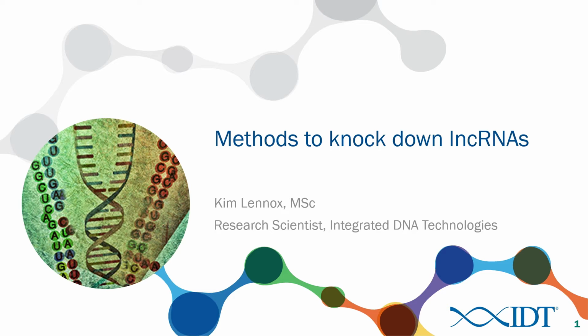Thank you for the introduction. Today's webinar is going to focus on optimal methods to knock down long non-coding RNAs. I'm going to compare two different commonly used RNA knockdown strategies, RNA interference and antisense, for their ability to knock down long non-coding RNAs and discuss whether or not there's an advantage of one technique over the other, depending on the subcellular localization of the long non-coding RNA.